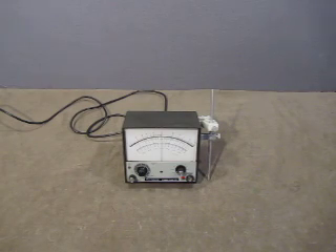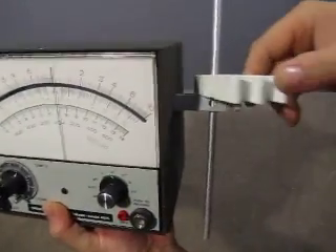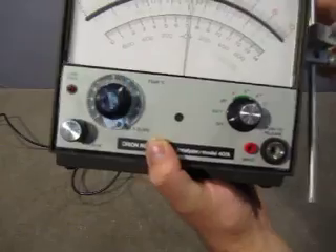Up for auction we have an Orion Research Ion Analyzer Model 407A. The unit itself has a mounting bracket here. It's a smaller unit, it's not bad.